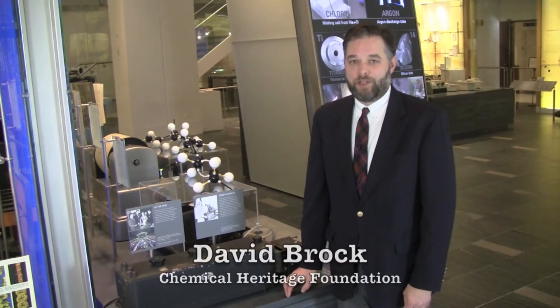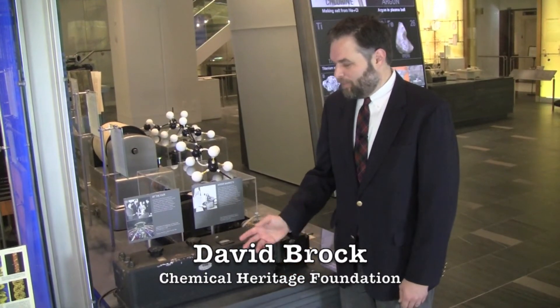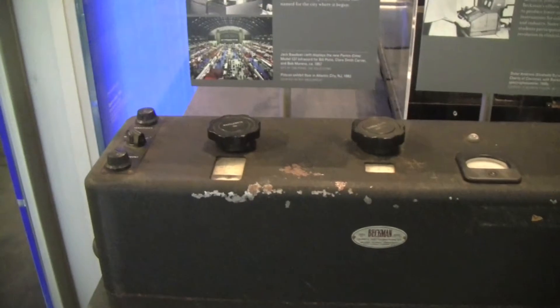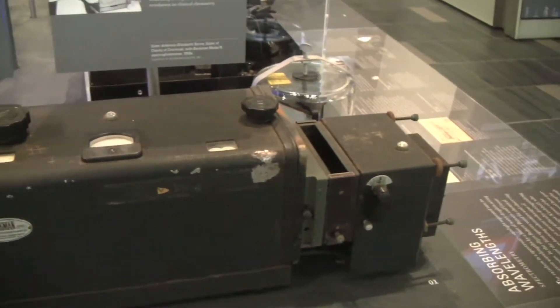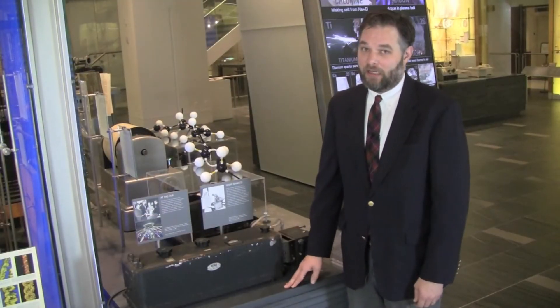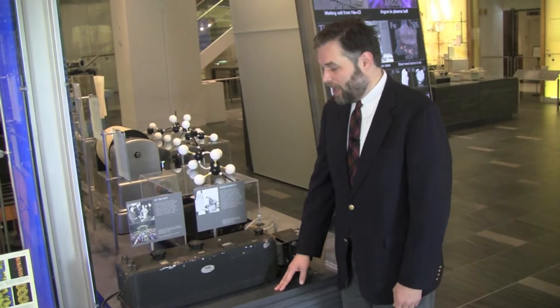I'm David Brock, Senior Research Fellow at the Chemical Heritage Foundation, joining you from CHF's museum. This humble-looking black painted metal box is actually quite a revolutionary tool of the chemist that played a key role in the transformation of chemistry in the middle of the 20th century. This is the Beckman Ultraviolet Model DU spectrophotometer.